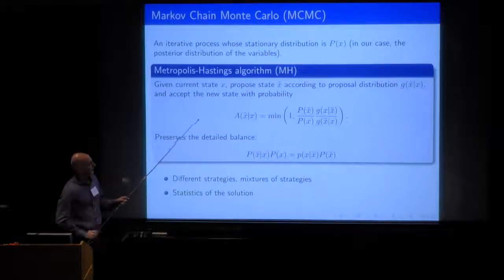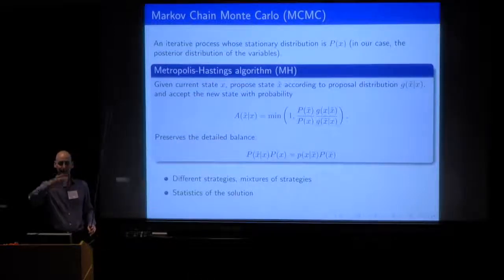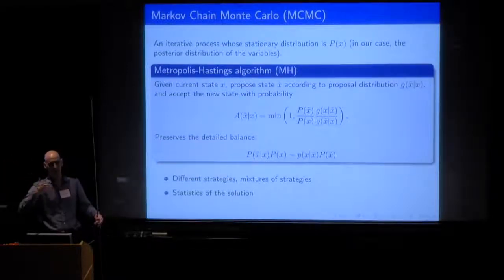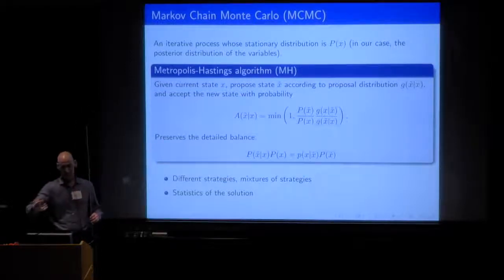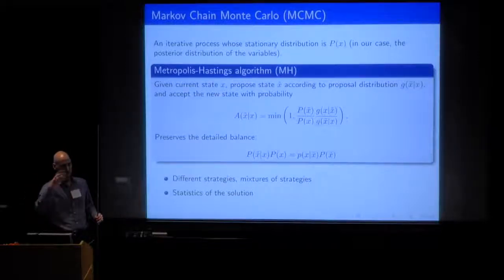The classic Metropolis-Hastings algorithm works like this: you have your current estimate of all your variables, you come up with another estimate, and you compute the likelihood for both. Then there's a computation that you do to decide whether you keep the current state or switch to another one. People usually think about it as perturbing the state a bit, but there are actually other ways of doing it.